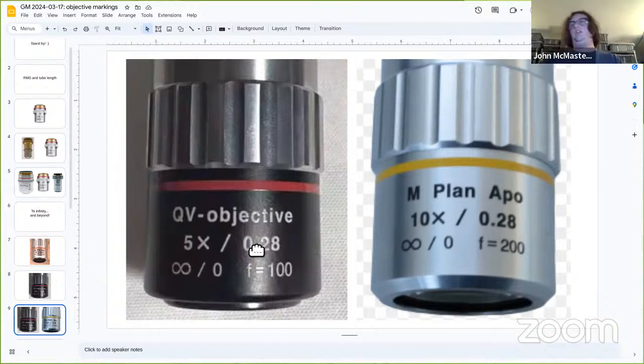So the sun is a great example. The sun is light that's essentially focused at infinity. In order to get a real image, like when you look at the ground, you don't really see a nice image of the sun, right? But if you take something like my glasses and focus it down, you're able to actually get an image of what the sun looks like. Does that kind of make sense?